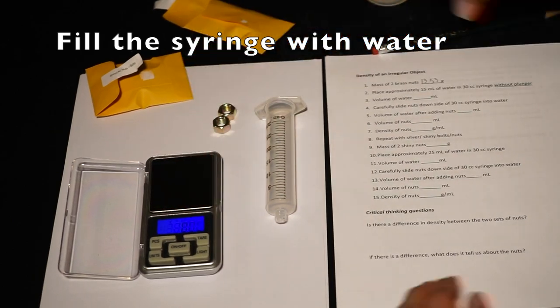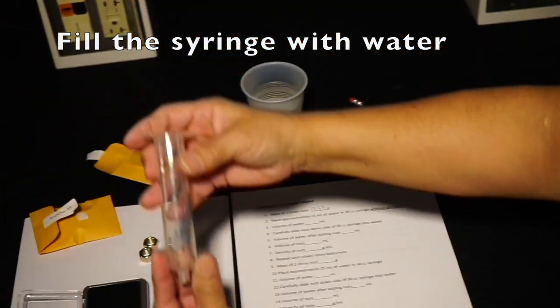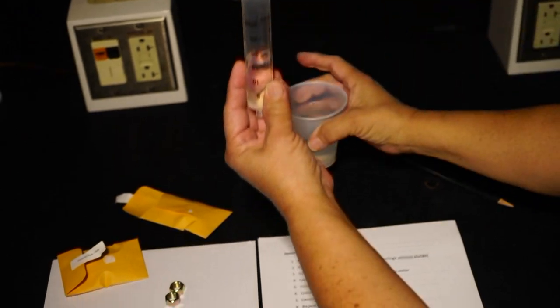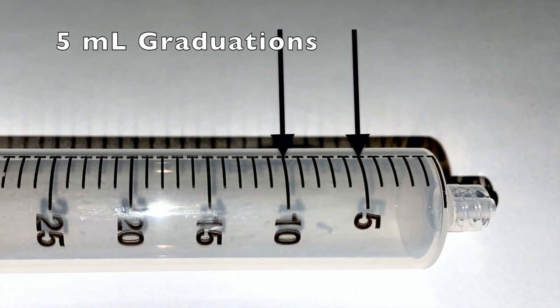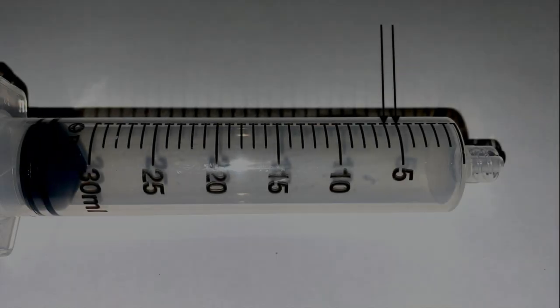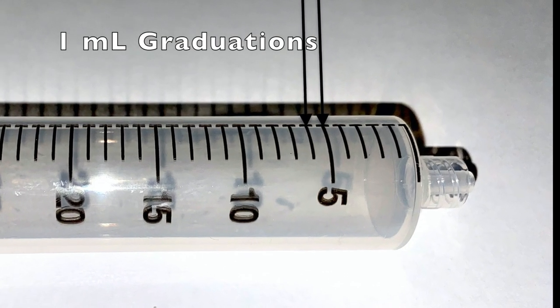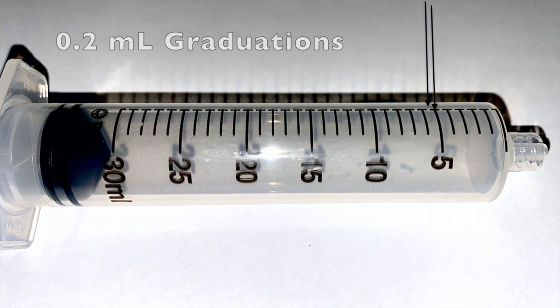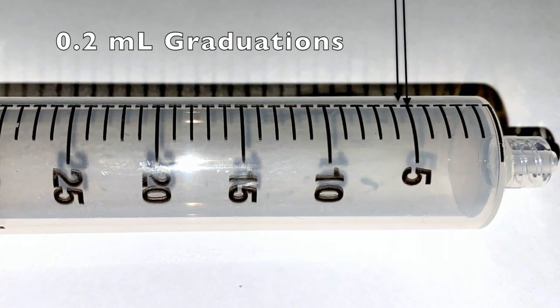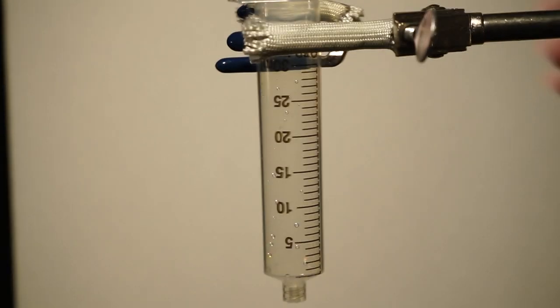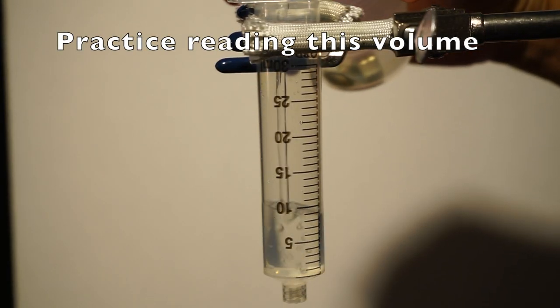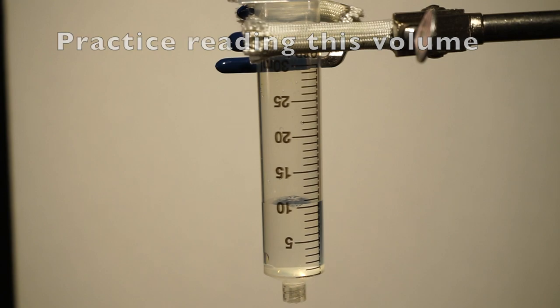Next, fill the syringe without plunger with water. Remember to read the graduations properly. The largest graduations are 5 milliliters, the small graduations are 1 milliliter, and the smallest increments are 0.2 milliliters. Practice reading these two examples.